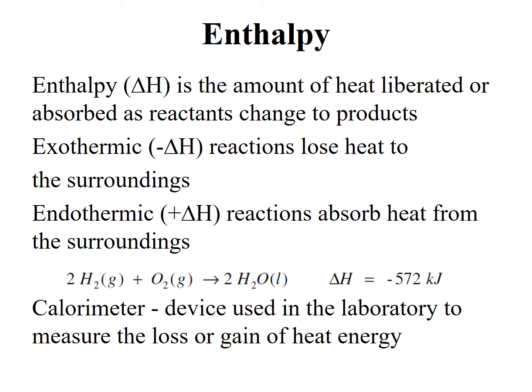Now, a calorimeter is the device that is used in the laboratory to measure the loss or gain of heat energy, and we will have our own homemade calorimeter, or the so-called coffee cup calorimeter. Okay, why coffee cup? Because it's made up of styrofoam cups.